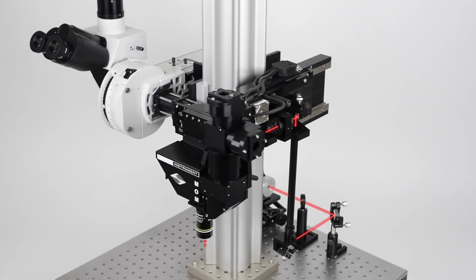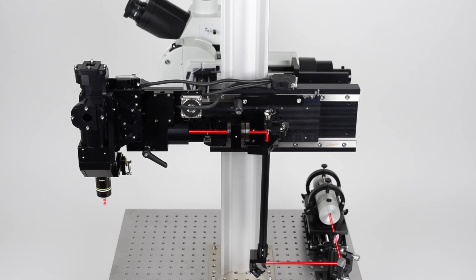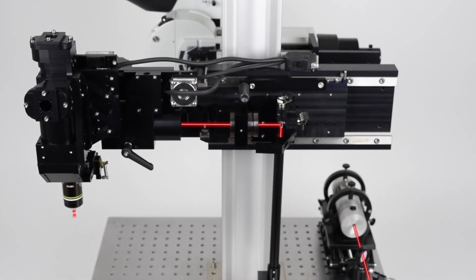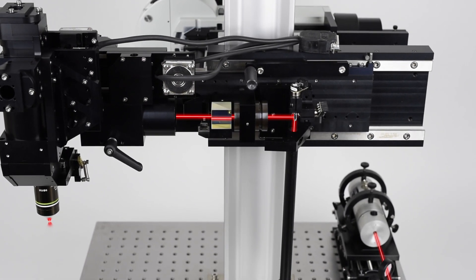Now what about modifying the internal beam path of the microscope? It turns out that accessing the beam path directly between the scan lens and the tube lens is also possible. A common example is to utilize a polarizing beam combining cube to couple a second beam into this position. A second set of galvo scanners and a scan lens can even be added to control the scanning of this beam to perform site-specific stimulation from a secondary laser.